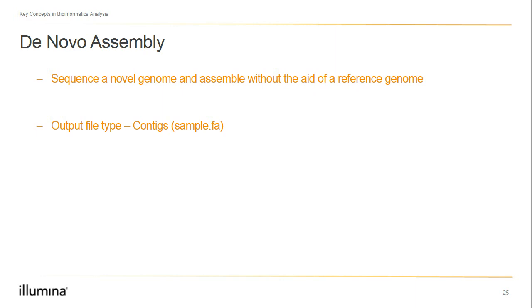Considerations will include the approximate size of the genome you're working with, the continuity of the contigs obtained and the organism. And by organism consideration, we mean, are you expecting for the genome to have a single chromosome, like many bacterial species, or will it have multiple chromosomes? Of course, an organism with several chromosomes will result in more contigs. However, it is also possible for a single chromosome organism to have several contigs as well.